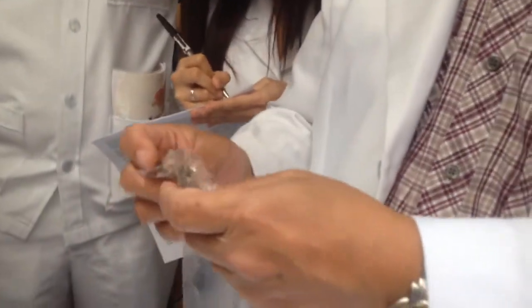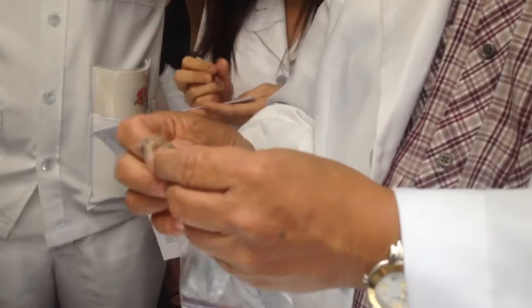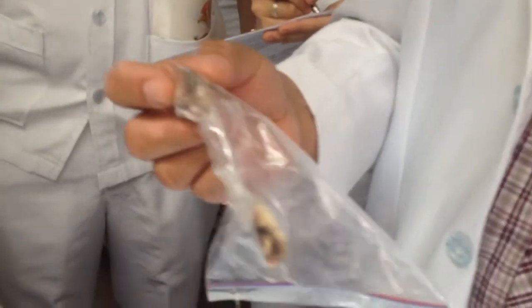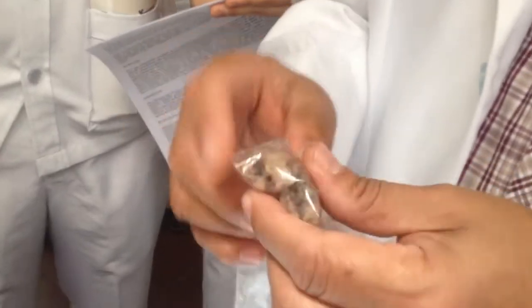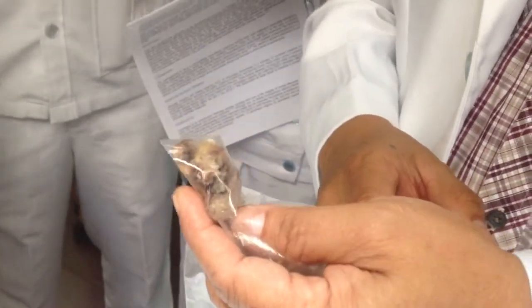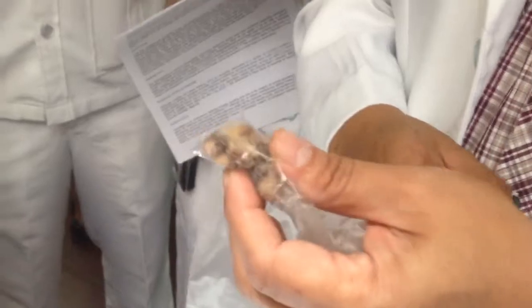location. If this is in the face, this is either verruca vulgaris or squamous cell carcinoma. So you should understand that a wart is a general term. Okay? So it will be the histology which will tell you ultimately whether it is benign or malignant, by doing a biopsy.